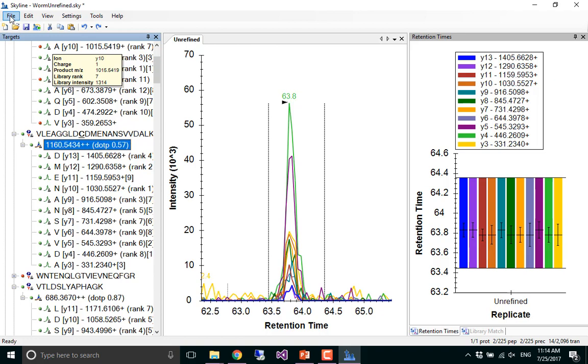How do we get the instrument method that measured it, and how many instrument methods did we have? Did we have just one? Yeah, we had to have 38 or 39 because this is a targeted run, and so whether it's PRM or SRM, we have to tell the instrument what to measure. So let's go through how to do that.